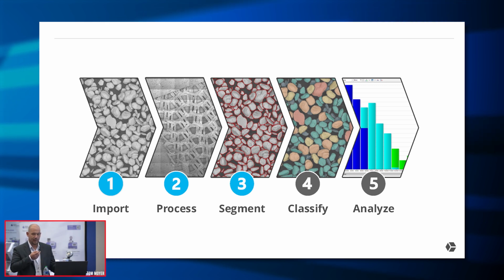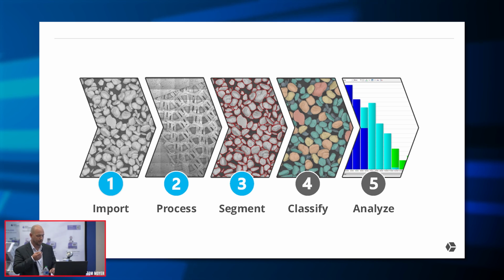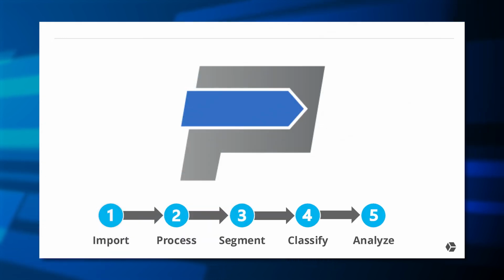So previous to this next feature, we included tools to get you through each one of these steps. And we had macro language where you could tie everything together and create a seamless workflow. That did require knowledge of our macro language and also a much deeper knowledge of Image Pro. So we have decided to implement application-specific, what we call protocols, that are guided workflows for specific applications that tie together each and every one of these processes.